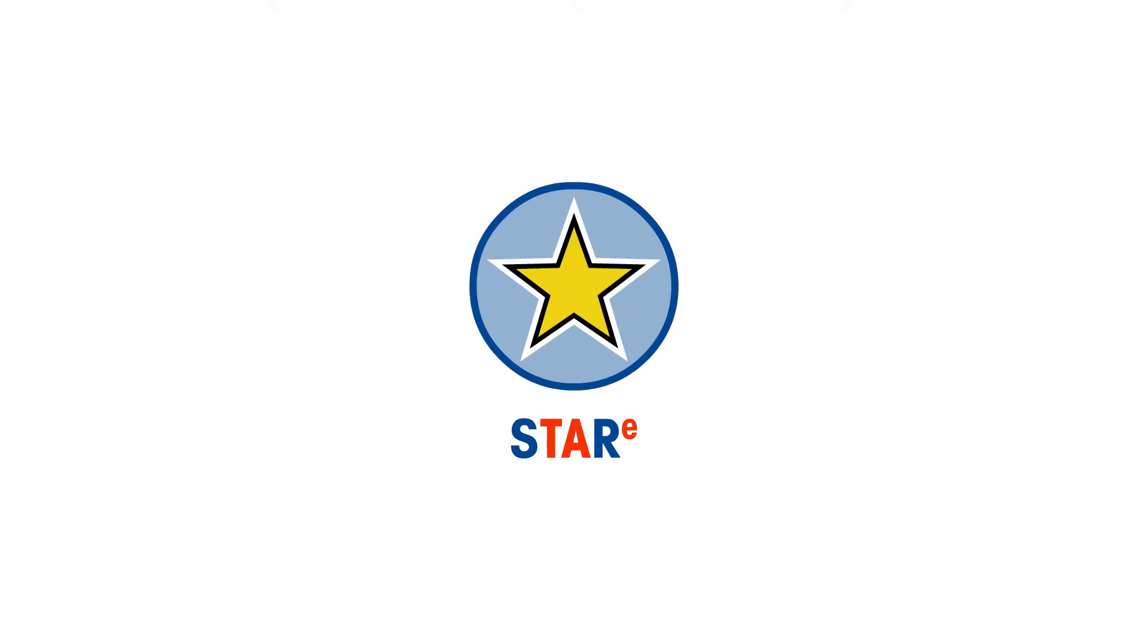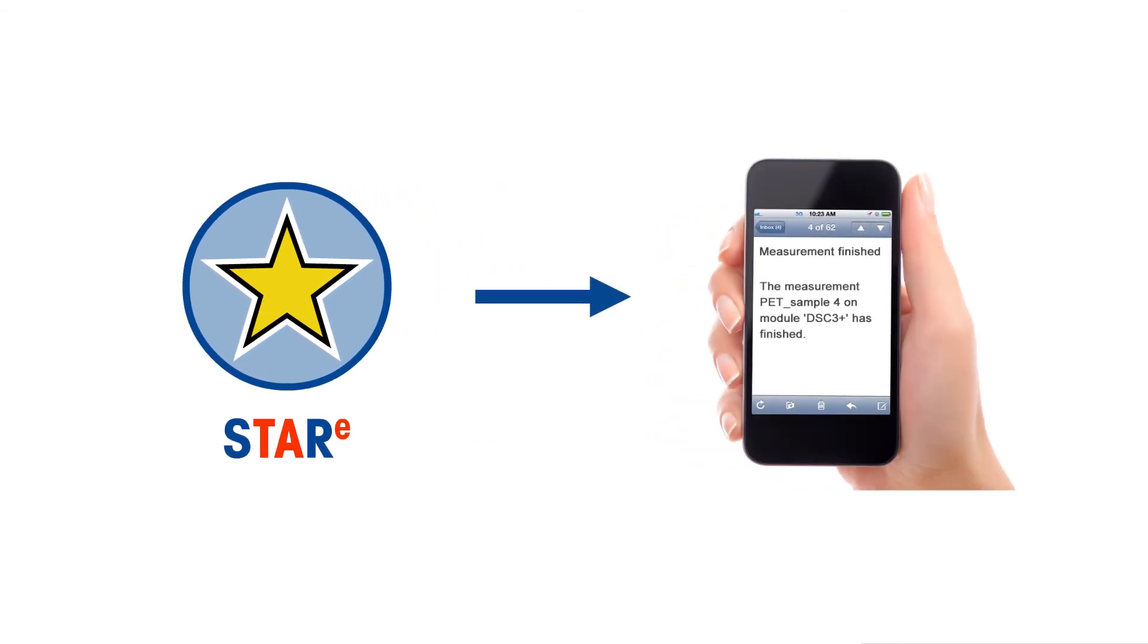You have seen how easy it is to schedule measurements with Mettler Toledo STAR-E Software. In addition to the measurement scheduler, the email alert functionality can be set up to receive instant updates on the progress of your experiments.